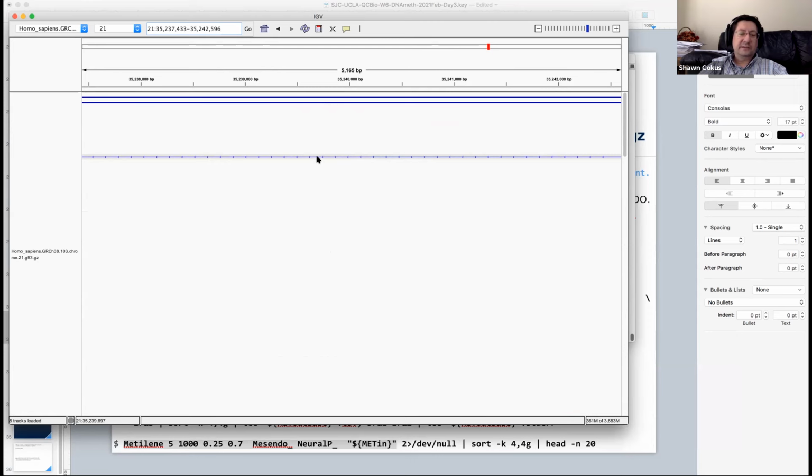What gene are we in, right? If we start hovering over these, what gene are we in? We're in RUNX1. Okay, RUNX1.